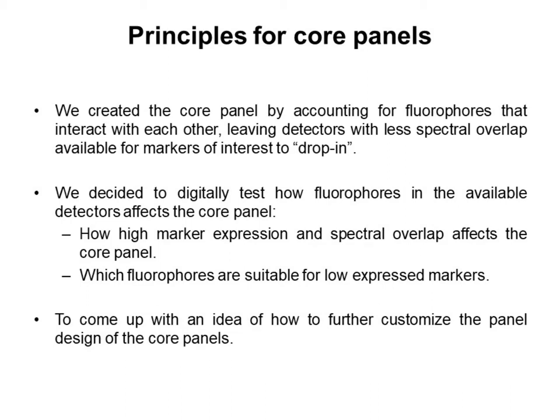So we tested how the fluorophores in the available detectors affect the core panel. For instance, how high marker expression and spectral overlap affect the core panel, and of course which fluorophores are more suitable for low-expressed markers, because it's also an issue we face daily. Okay.